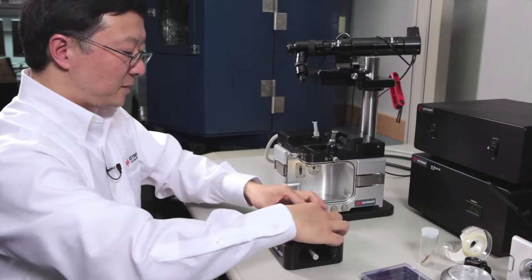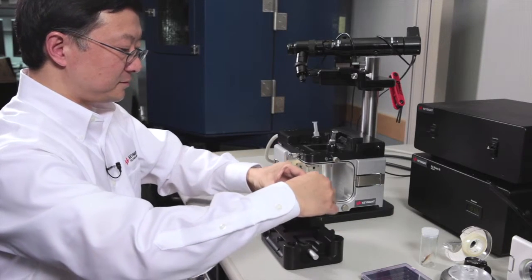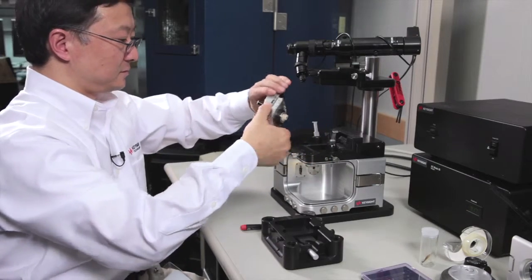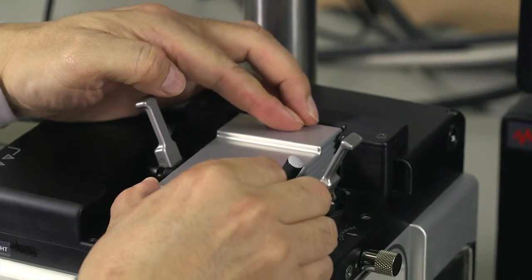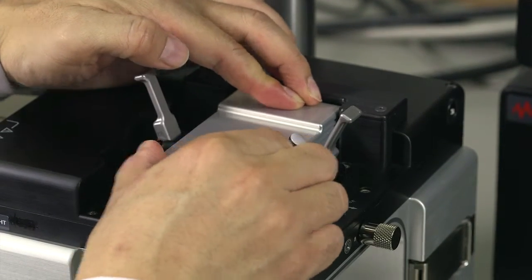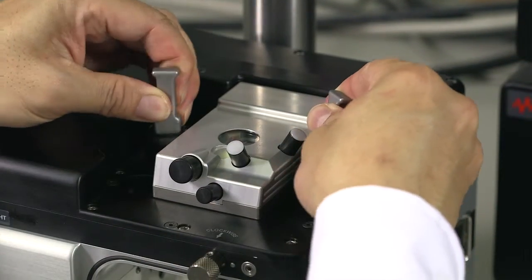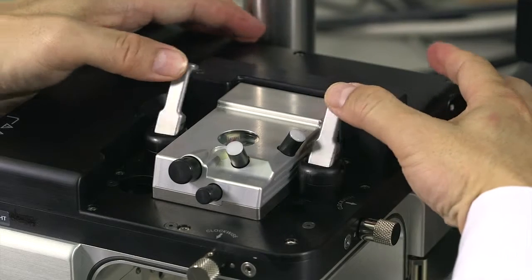Next, we pick up the scanner, insert it into the AFM body, rotate the two levers, and lock down the scanner.